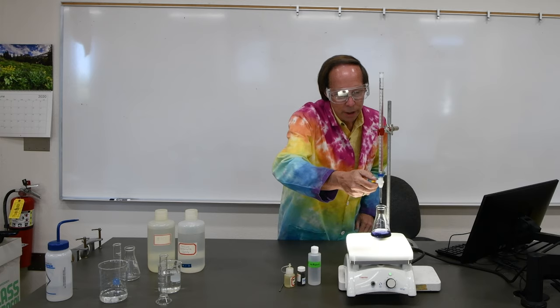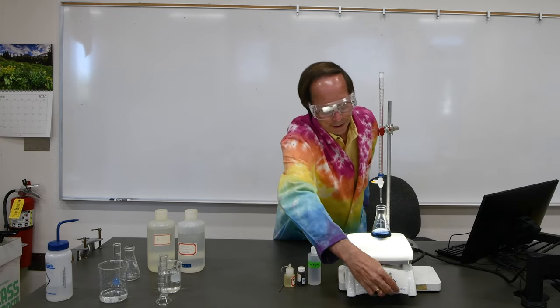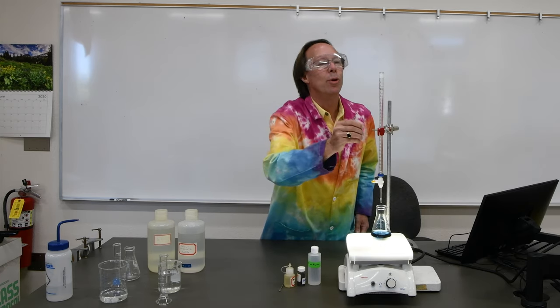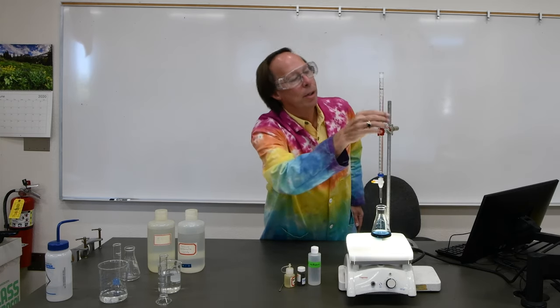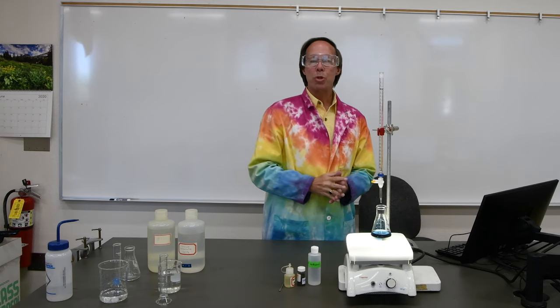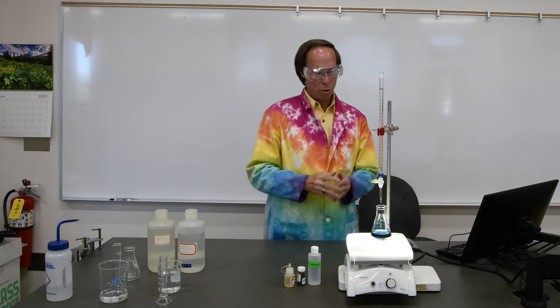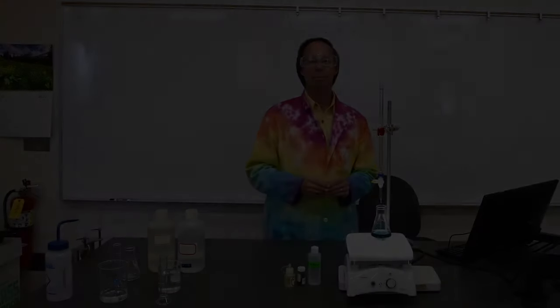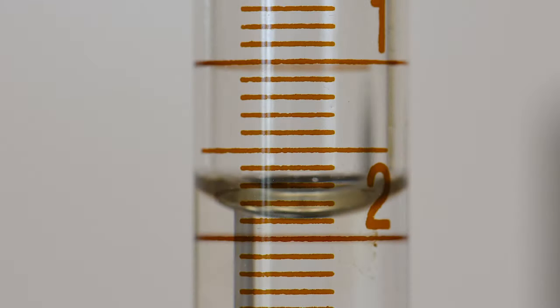And it looks like we've got it. So it's turned blue. We probably added a bit more than we needed. So we'll take a measurement here in just a moment, and let's see how much we used, and then we will do two more titrations, and this time we'll come up on it much more slowly. This is the final burette reading for our rough trial of the unknown calcium carbonate sample. And this will also, of course, be the initial burette reading for our next trial.